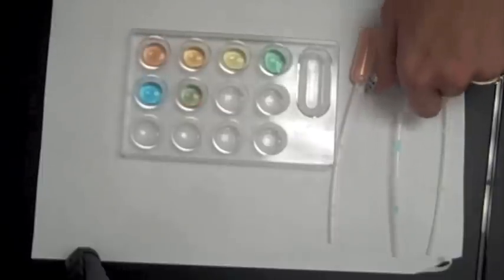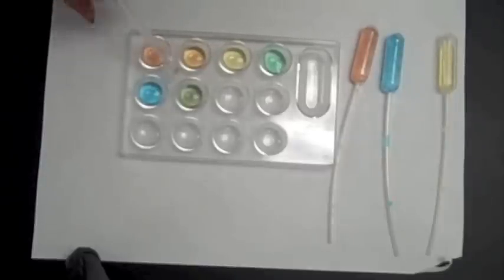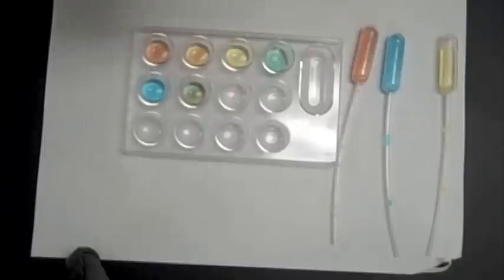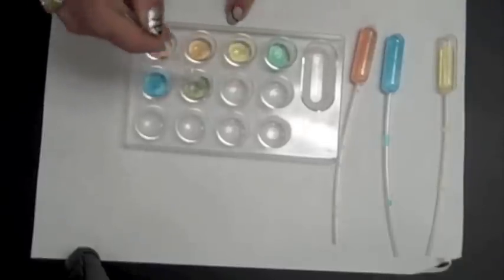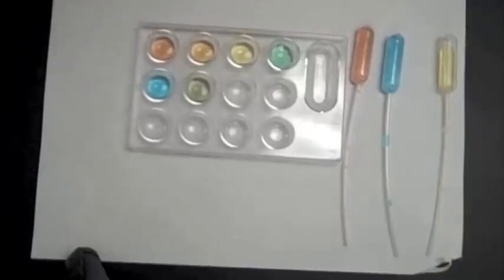Now, it tells us to take our glass stir rod and stir each of the little wells. Obviously, we don't have to do this one because it was just red. Make sure you clean off your stir rod in between. And what do you see? Purple's looking a little weird, but you should see a rainbow.